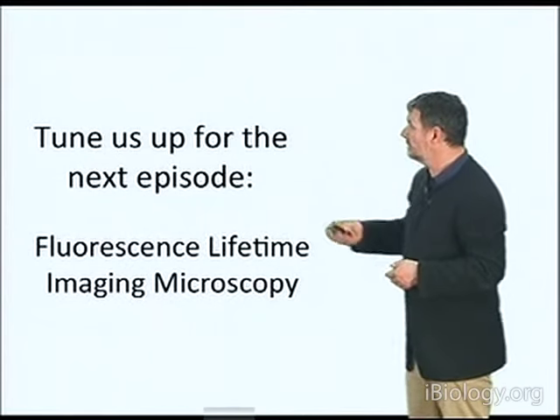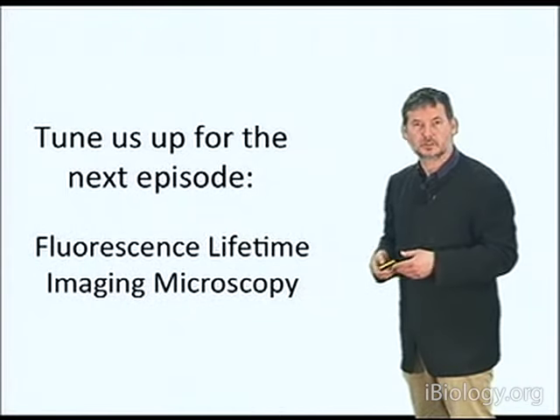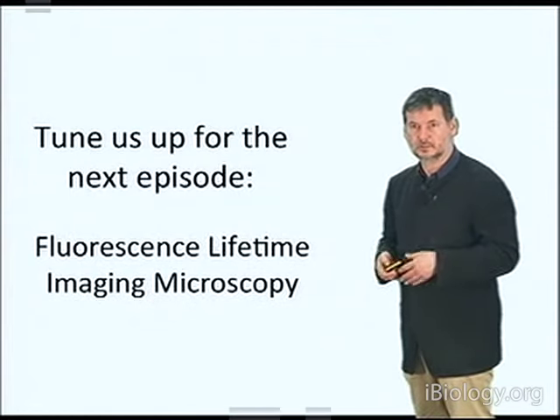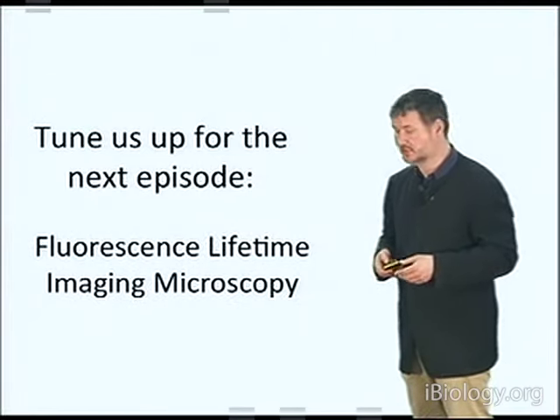So next time I'm going to elaborate on this fluorescence lifetime imaging microscopy, because it deserves a separate discussion, because it's the most quantitative of the three approaches and allows you to do quantitative biology and better understand how molecular reactions, for example, are important for spatial organization.